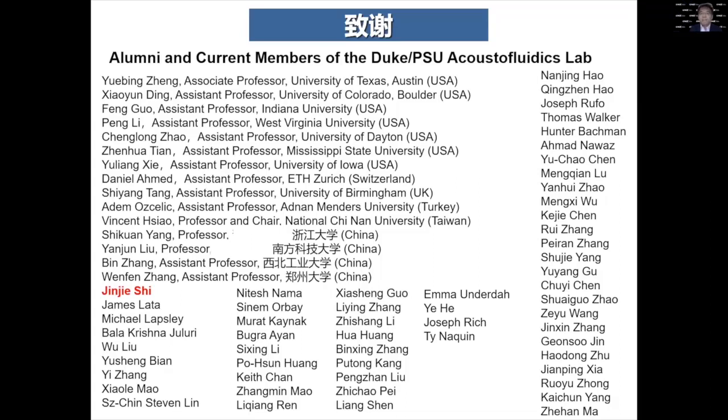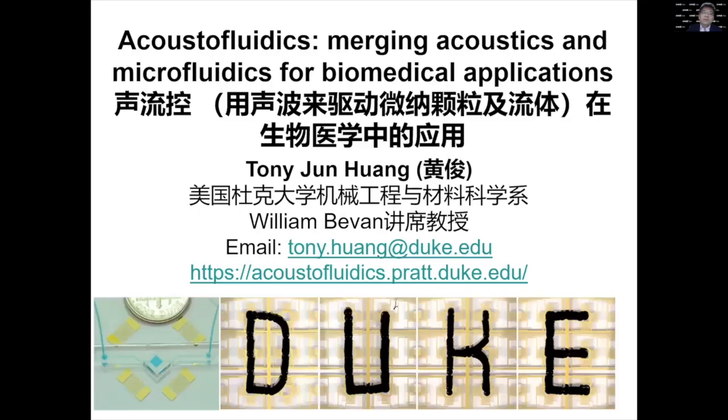So today I'm going to share with you our work on acoustofluidics, which means the fusion of acoustics and microfluidics. And we mainly do it for biomedical applications.